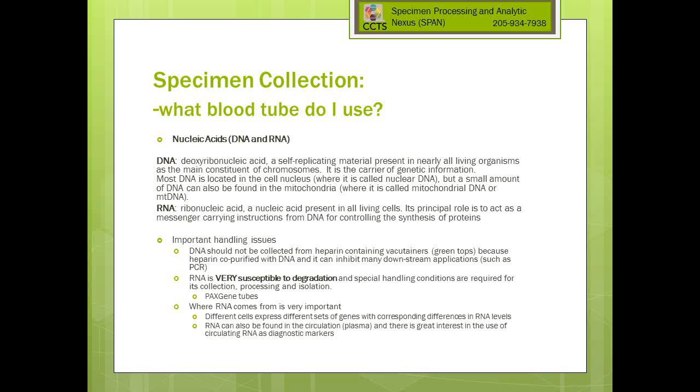And there actually is an example here in UAB where we have helped a study isolate RNA from plasma. Again, this was from EDTA plasma. They were looking for markers of colon cancer, and this was published just last year. Dr. Wilcox was the PI here at UAB working with a group at HudsonAlpha, and they discovered a set of microRNAs, which is a type of RNA that is found in circulation that is predictive of the presence of colon cancer in patients. So it could be a potential biomarker for the diagnosis of people with cancer.